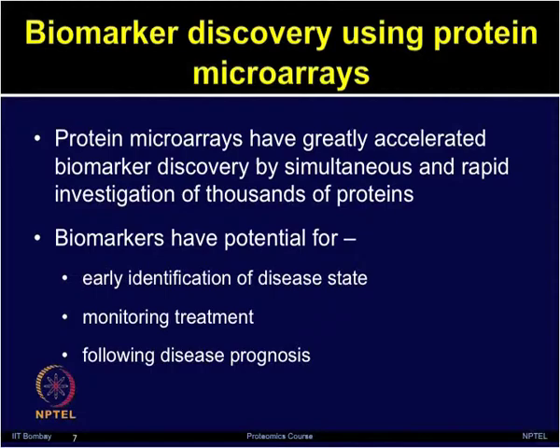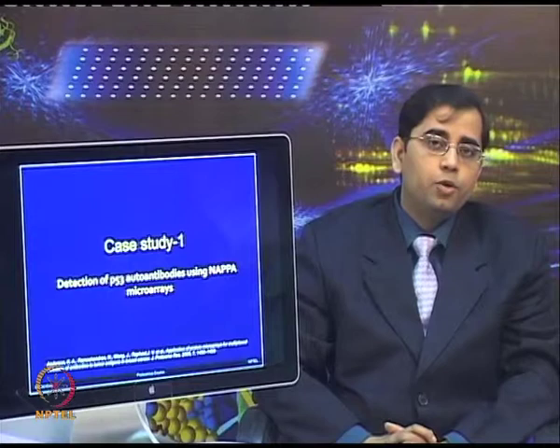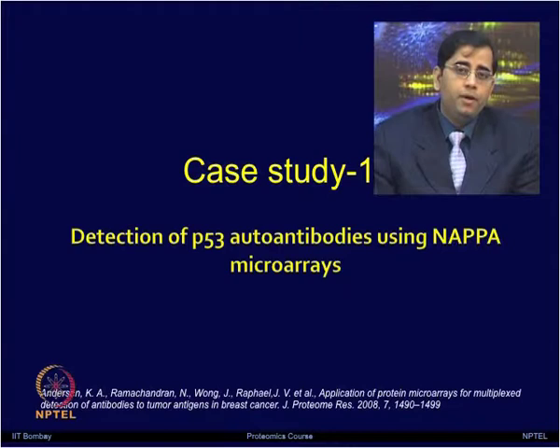So, let us look at how cell-free expression based protein microarrays have been employed for screening for biomarkers. I am giving you case study 1, detection of P53 autoantibodies using nucleic acid programmable protein arrays. The study was performed by Anderson et al.